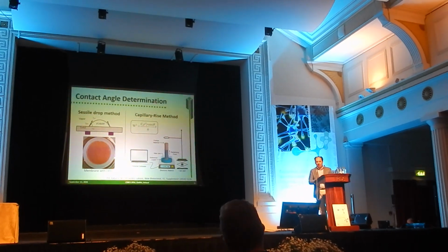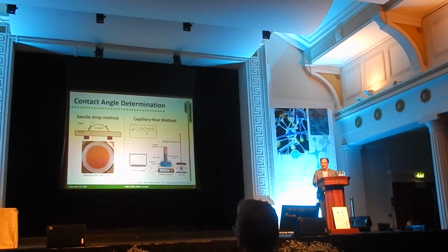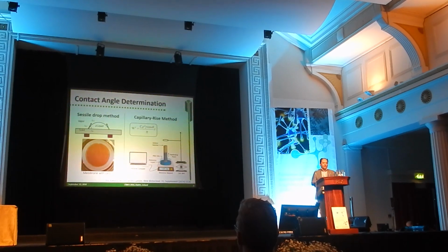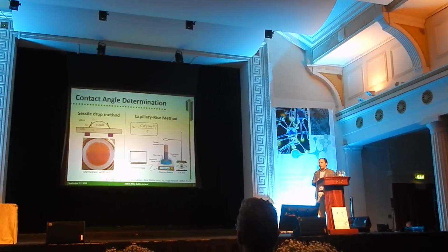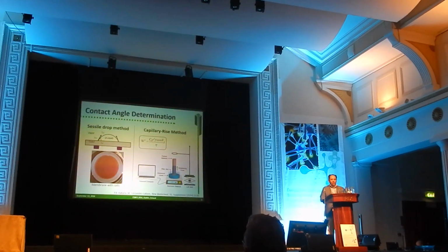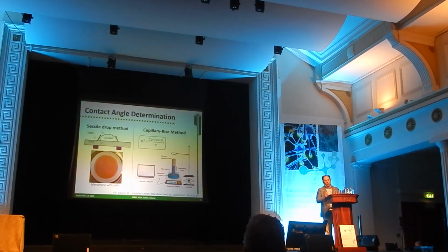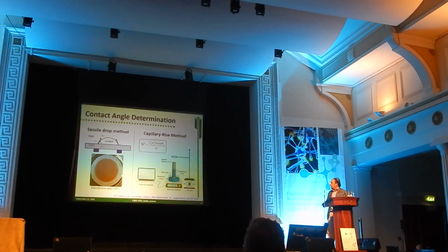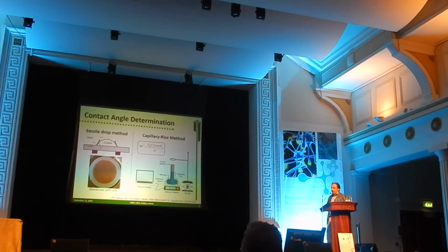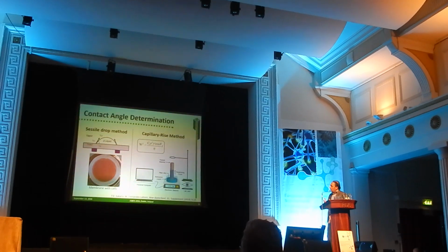I will not explain every single detail here, but just to let you know that these techniques for this kind of measurement are, for example, used by physicists on very smooth surfaces of materials, right? In this case, measuring contact angles on cells is much more difficult. There is a specific time window within which you can really do an accurate measurement. So it was a lot of work to develop the right techniques and the right portfolio here.